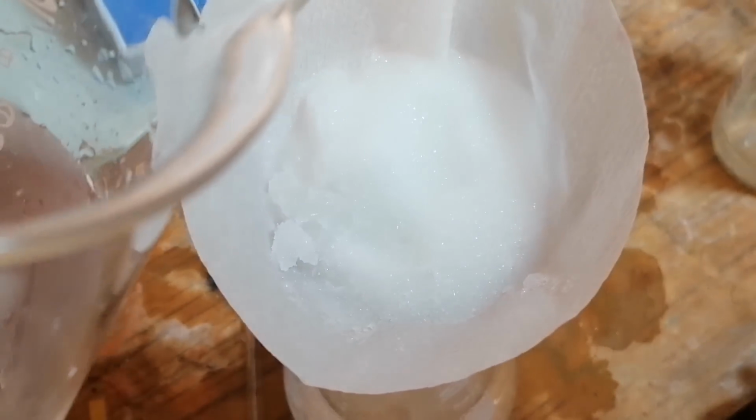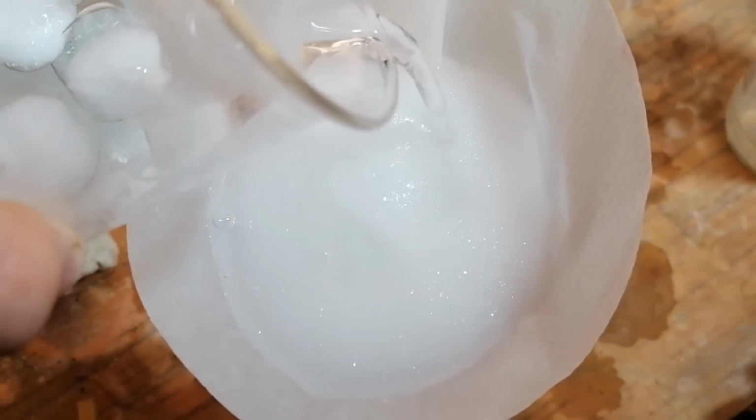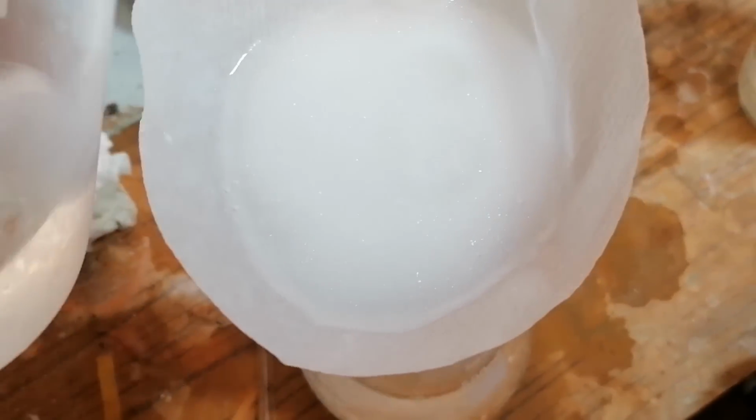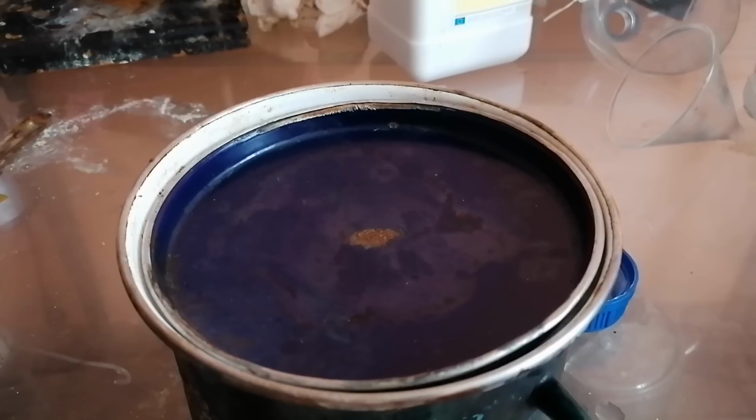The boric acid crystals were washed with ice cold water to get rid of impurities. But I didn't really have distilled water, which kind of came back and bit me in the ass later, because it contaminated the whole thing with some strange salts. Anyway, right now boron is in the form of this really annoying ion called borate, which can't really be converted to boron. So to proceed we have to reduce the borate ion.